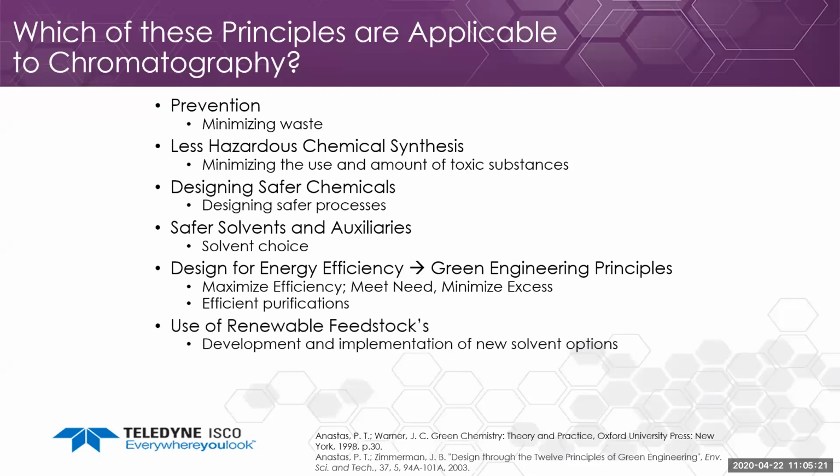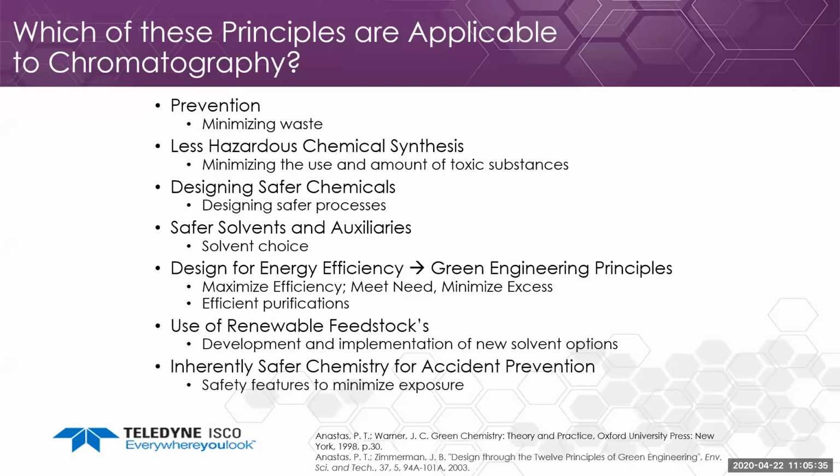Then the use of renewable feedstocks: as newer renewable feedstocks are implemented, how can we use these new solvent options and make them more readily used? And then inherently safer chemistry for accident prevention. So what kind of safety features in our purification equipment can be useful to help minimize exposure?